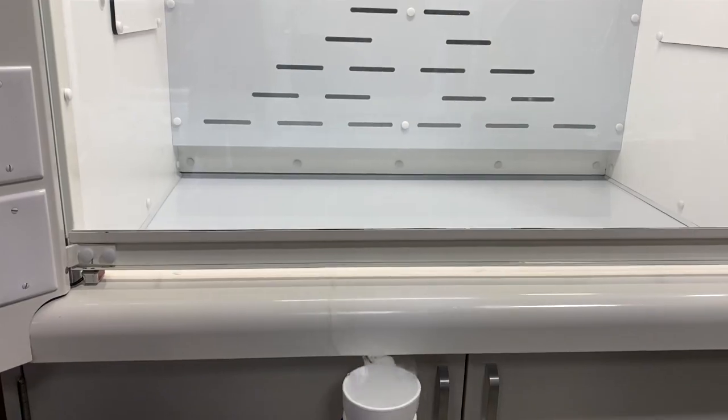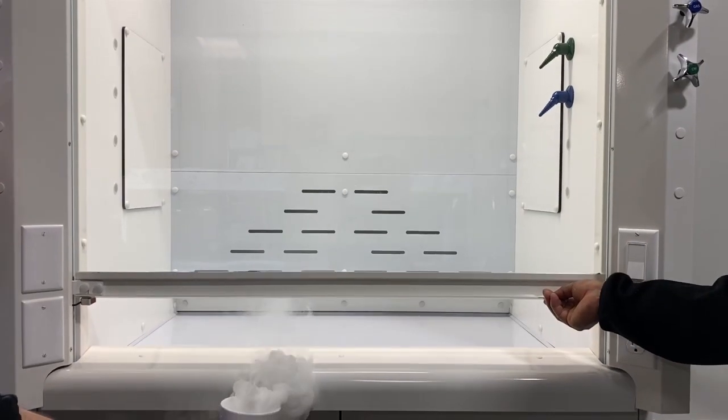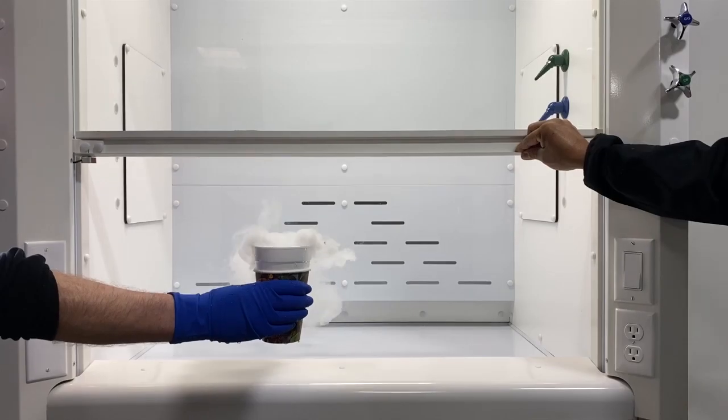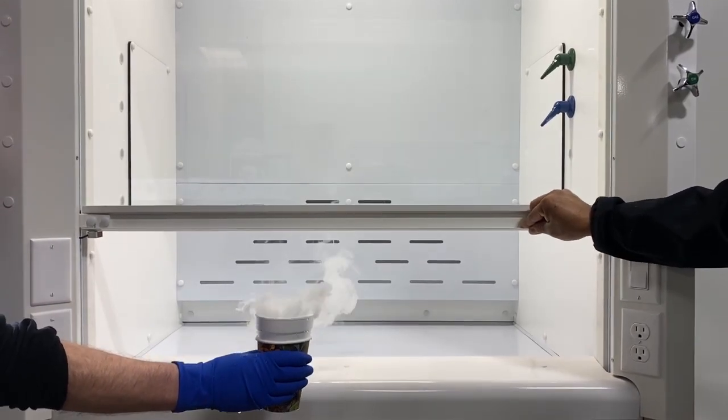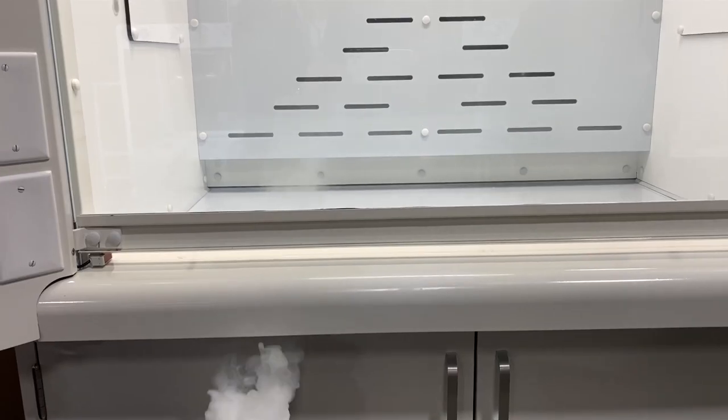Aerodynamic sash foil and vertical fascia provide even airflow by avoiding sharp curves that can create turbulence. When the sash is lowered or closed, air enters the hood from underneath the airfoil and the opening along the top of the hood.